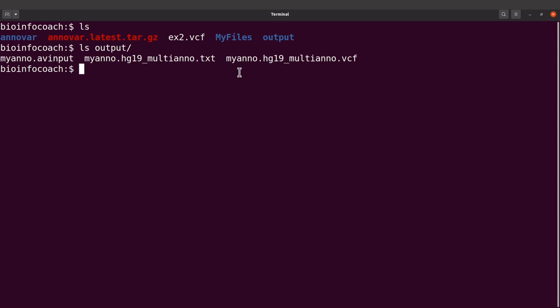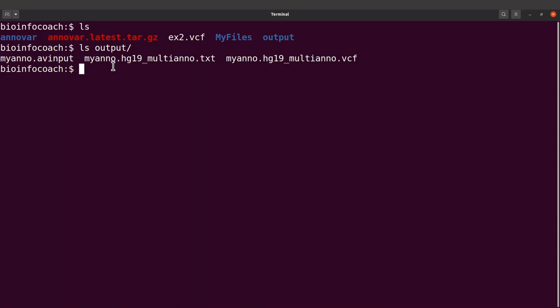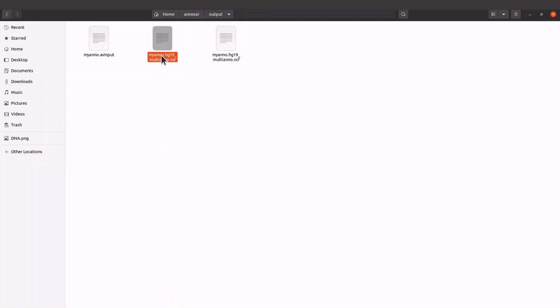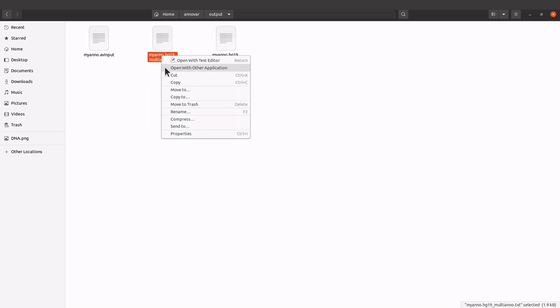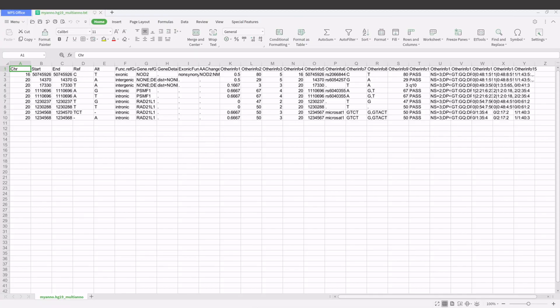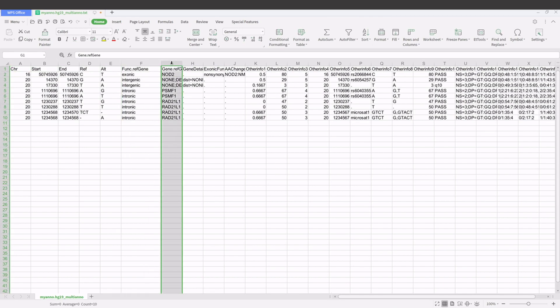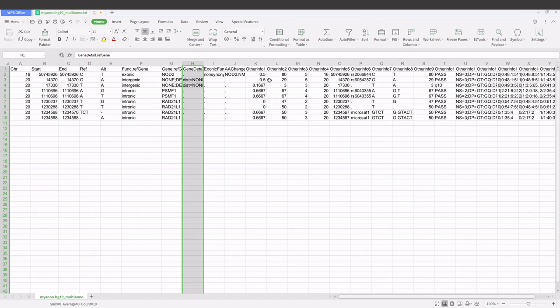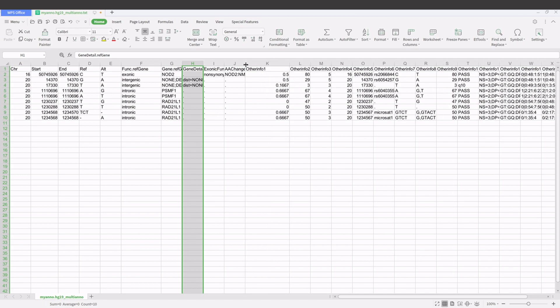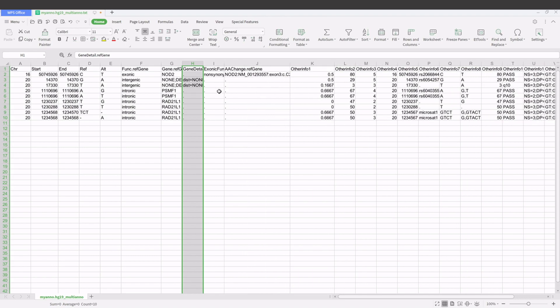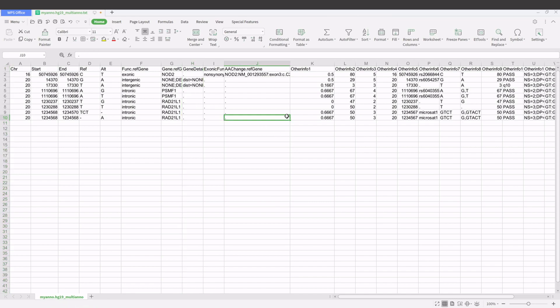The VCF output file has information from the original VCF as well as the annotations that ANNOVAR added in the info field. I'm going to open this file using spreadsheet software. We have our chromosome, start, end, ref, alt, and the annotations. In addition to refgene, there are other protocols you can also specify — I've covered that in another tutorial. This is just an introductory video, so that's it.